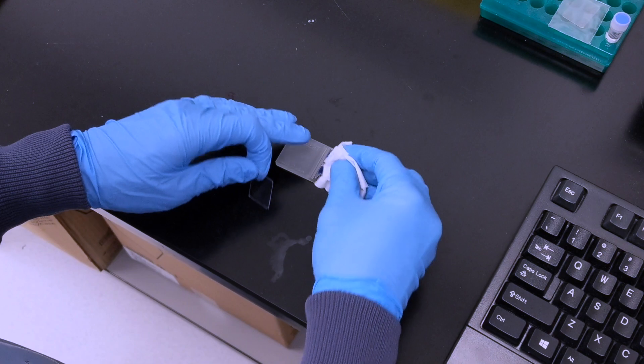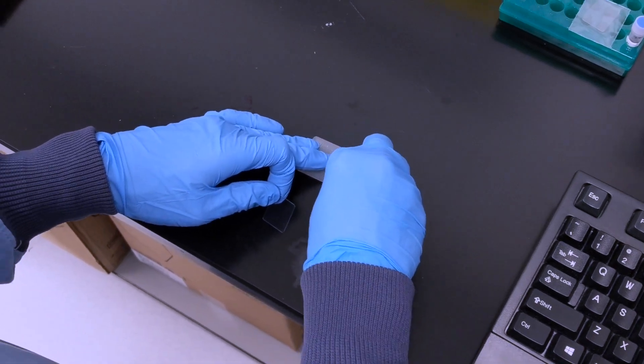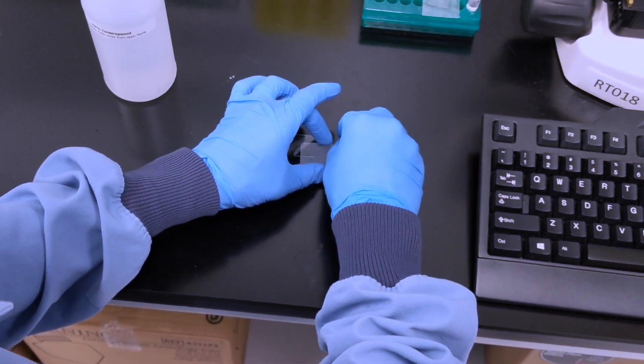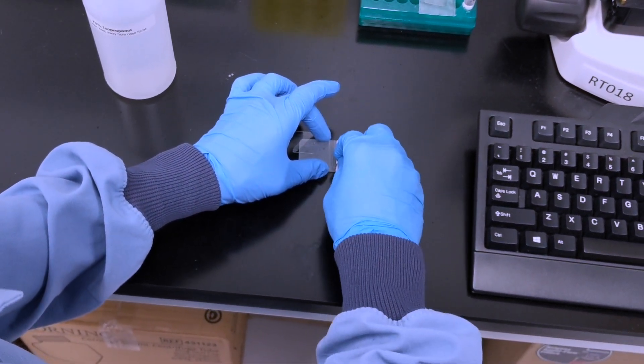If you are working with a reusable hemocytometer, it can be rinsed with water, further cleaned with a solution of 70% alcohol, and stored for future use.